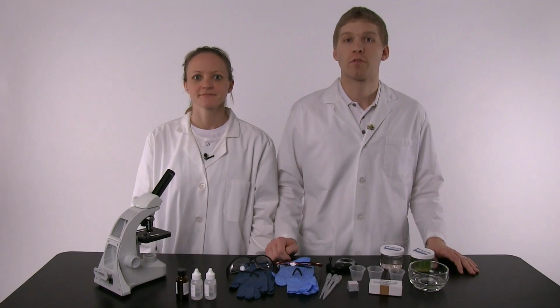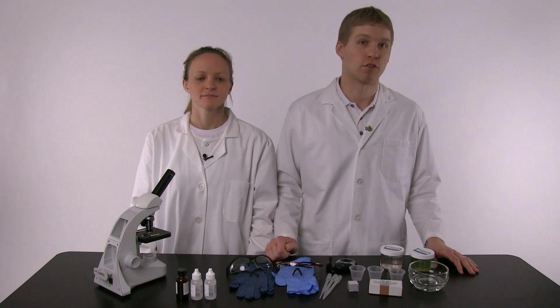Jordan and I did an experiment with Daphnia. We observed the heart rate when exposing the animals to 3 different drugs: aspirin, adrenaline, and lactic acid. We first recorded the normal heart rate of the Daphnia before exposing them to the drugs as our control.